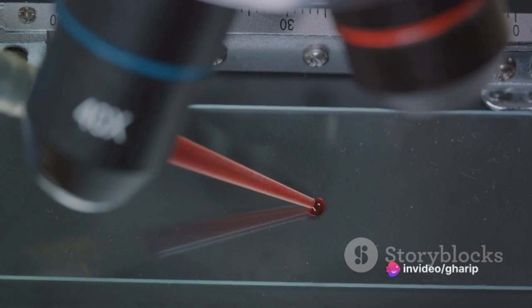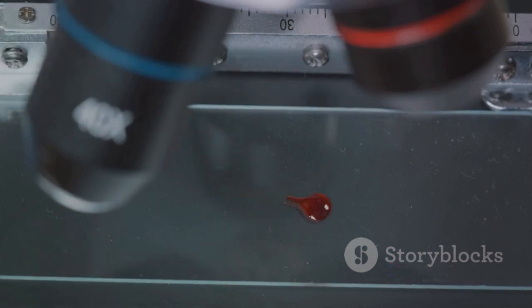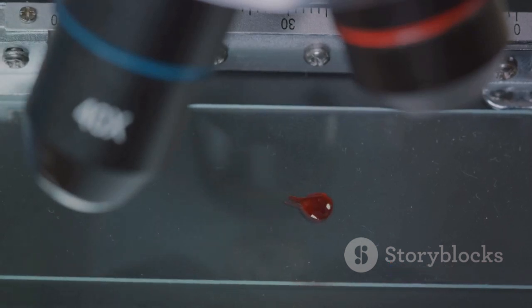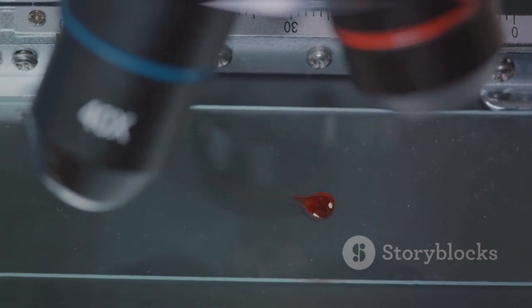Specialized thermal cyclers equipped with fluorescence detection modules monitor this fluorescence, providing a real-time measure of the DNA amplification.